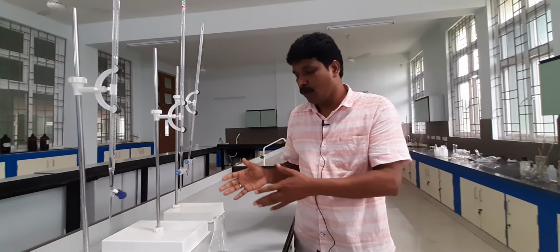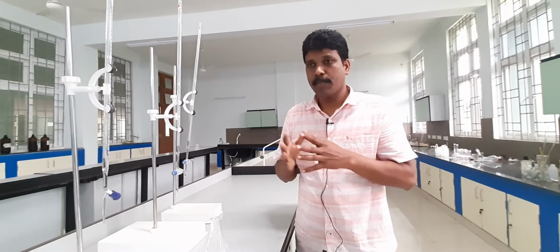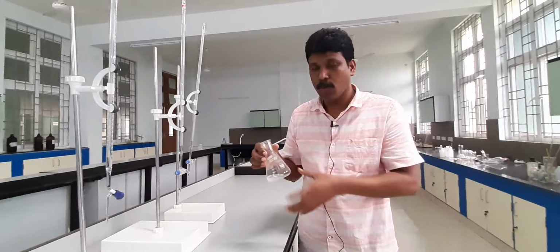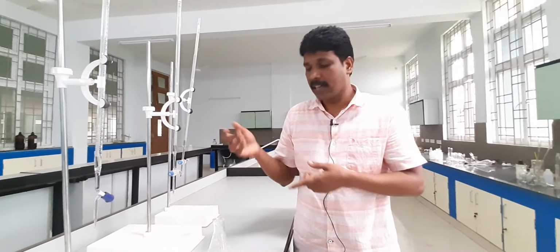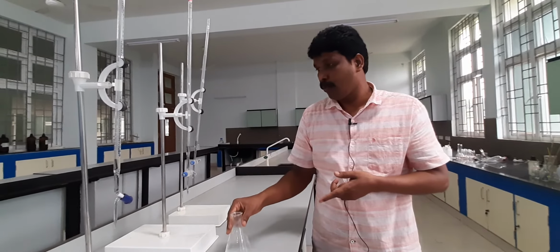You have to have a few conical flasks. All these conical flasks you have to properly clean and then dry from time to time. You cannot take any wet conical flask. The way I have taken, you shouldn't take it, but the conical flasks basically need to be ready. Once they are done, then we will be taking readings and then we will post to you.